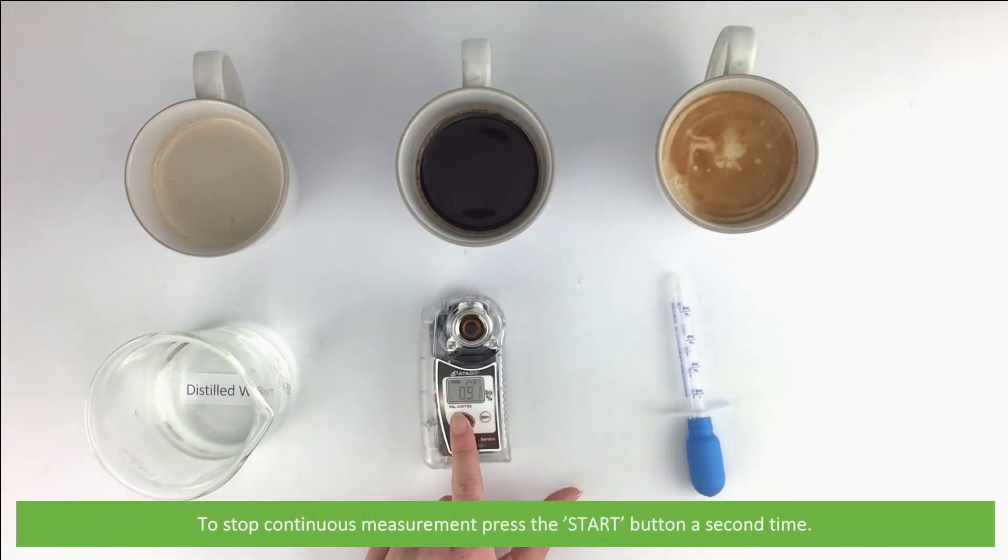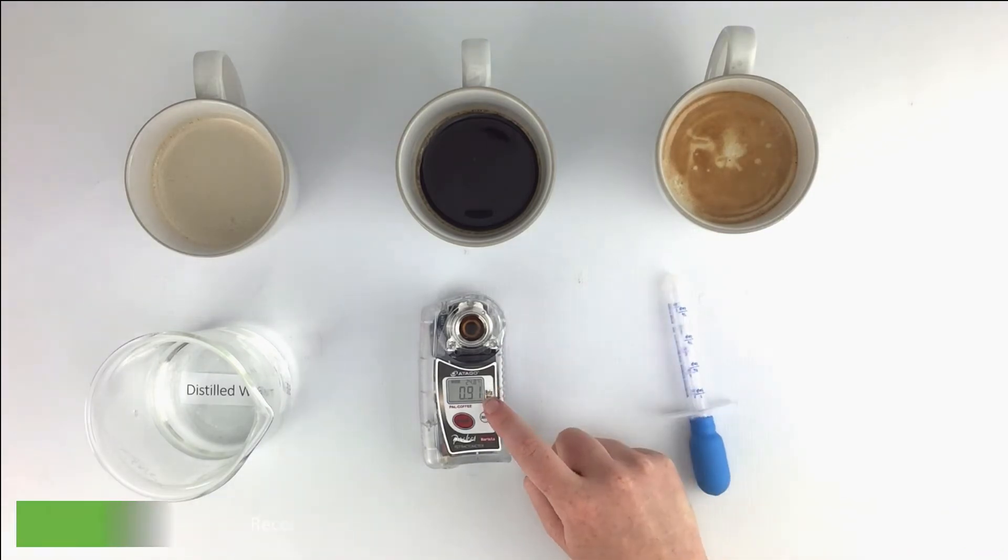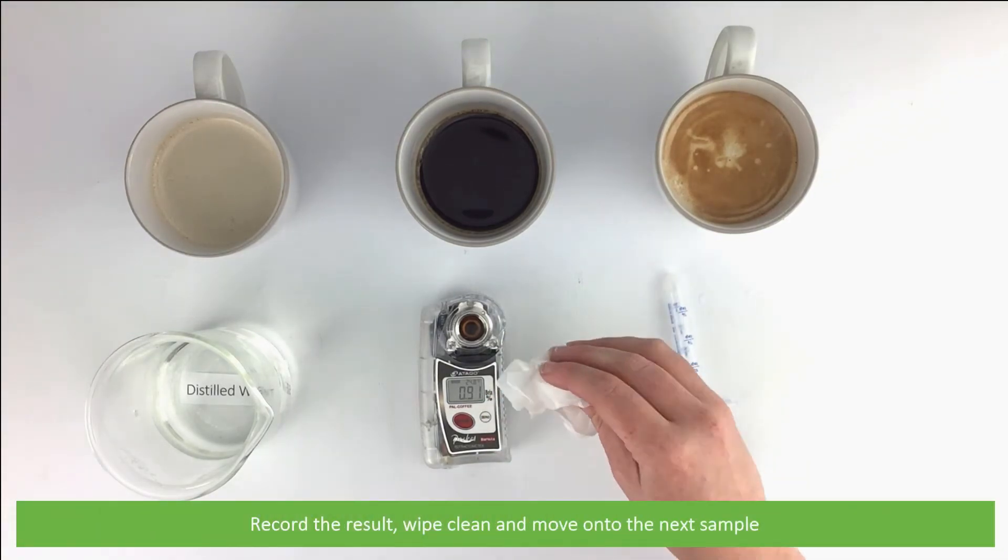Continuous measurement is indicated by the result flashing and adjusting on the screen. To stop the continuous measurement, press the start button a second time. Record the result, wipe clean, and move on to the next sample.